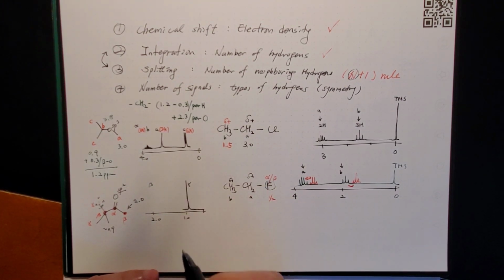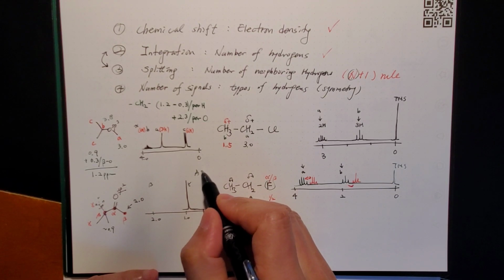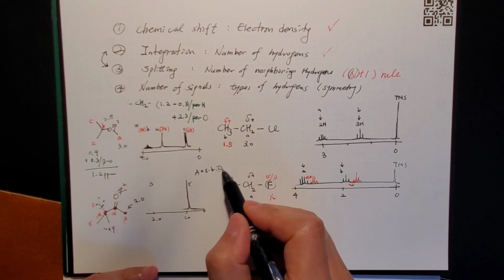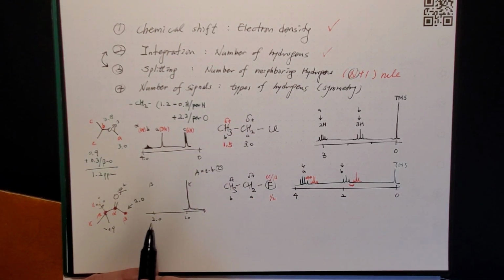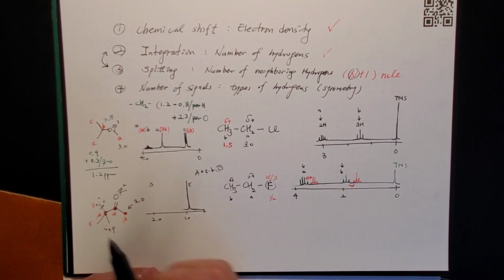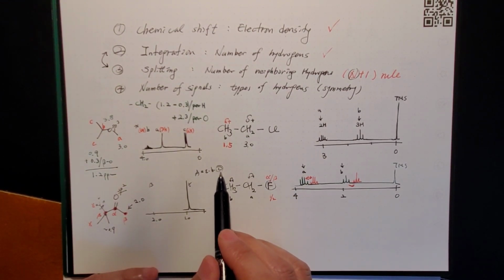So 9 times, remember? Like your IR. You have so many same CH stretching, sp3 CH stretchings. You got the tall signal, same thing. You have the same CH bond 9 times the concentration of the molecule.